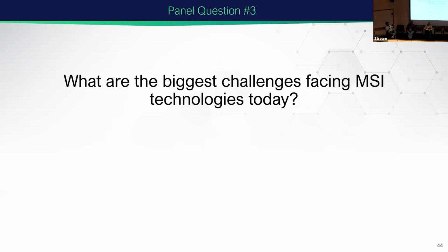And on top of that, if you want to do real structural analysis, you may want to do MSMS. So maybe parallel ion mobility MSMS may help. But at the moment, the biggest challenge is that I think it'll take another 5 years or more.